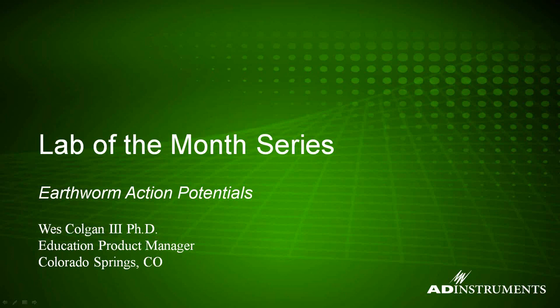Today we're going to be talking about the earthworm action potentials. I'm going to show you a couple of different techniques for using this prep in your courses. We'll talk about both Lab Tutor and LabChart applications here. And today I think we're going to go ahead and start with the Lab Tutor version.